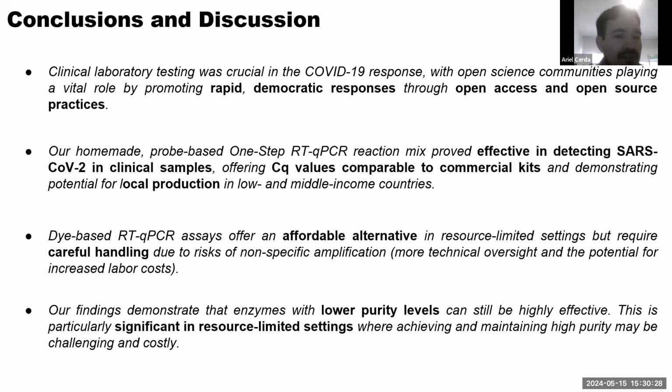Our study indicates that enzymes of moderate purity are still effective for RT-qPCR assays. This is crucial for resource-limited settings where high purity levels are hard to achieve and maintain. We think that locally produced enzymes can reduce costs and improve access to essential diagnostic tools without compromising performance.